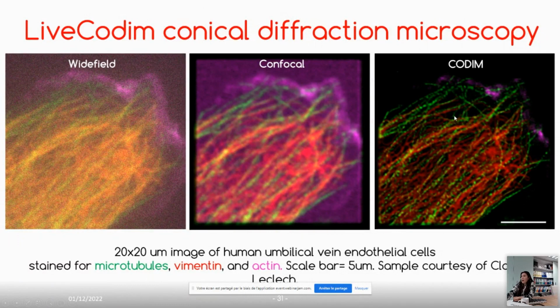Here, that same image you just looked at, those microtubules, we saw that they had a spotty-like structure using the STORM technique. What we can see here is actually the same punctate labeling. We're using antibody labeling, and this is not an artifact, but a real observation of the discrete nature of antibody labeling of a microtubule.